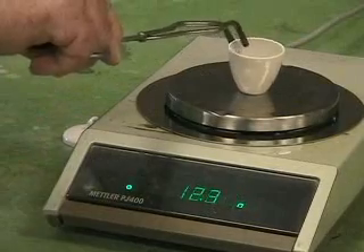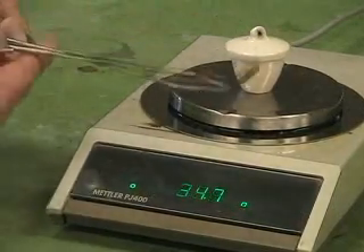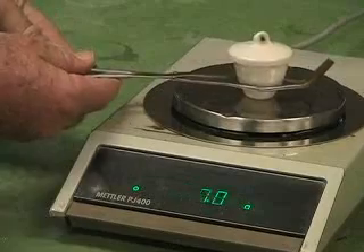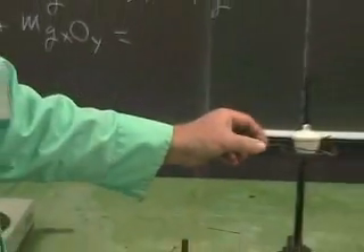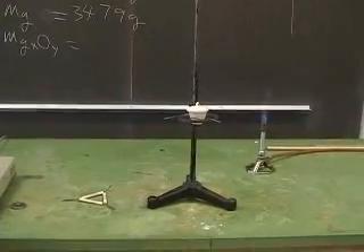Notice that I'm not handling the crucible too many times, because the oils from my fingers will change the weight of an object. As I do the experiment I want to practice with these tongs — these are called crucible tongs, and they're specially made to handle crucibles and their lids because these things are usually very hot when you go to remove them. This is the way you pick up a crucible with crucible tongs: you gently squeeze it, not too hard. Otherwise it'll squeeze out, and I would place it into the wire triangle that allows it to be held above the Bunsen burner.